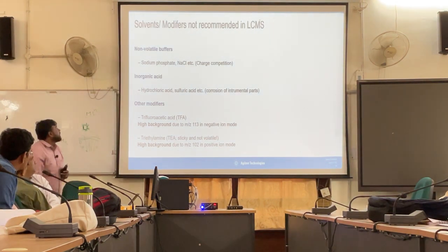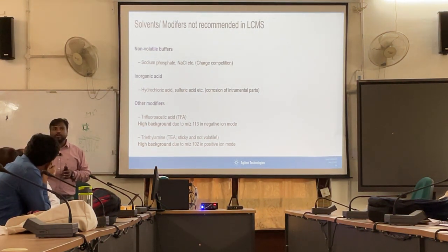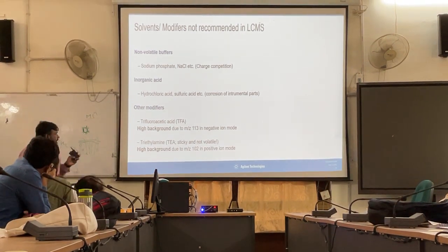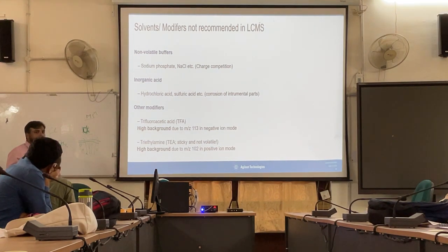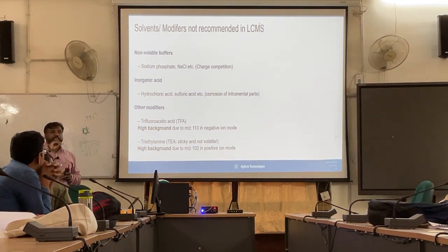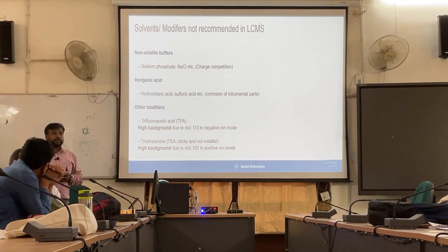Okay. Having said that, we have limitations, and we have a very small number of solvents we can use as diluent or mobile phase for mass spectrometry. The reason is, if a solvent leaves residue in the source, that is ultimately deposited in the source and clogs the capillary, so there would be no ion transmission, and ultimately you would not get any response.